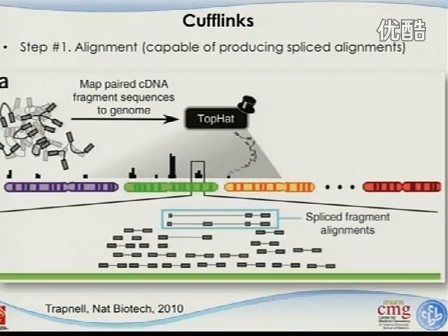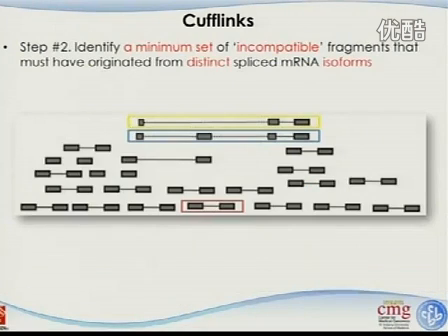And for this one, you can see that this is a solid part, actually. This is the part that was not sequenced. But this is the dashed line, and this part is the junction part. So one read is across the junction. And you will see this is a spliced fragment alignment. So this is after alignment, you will see this.